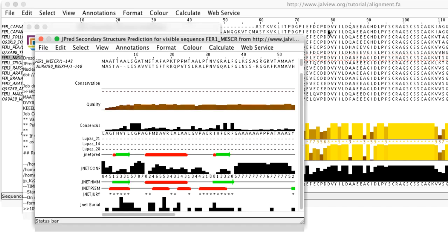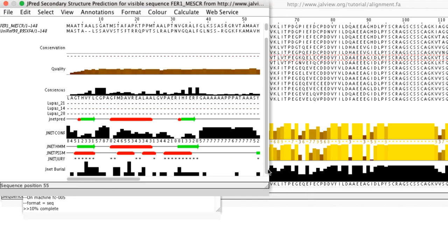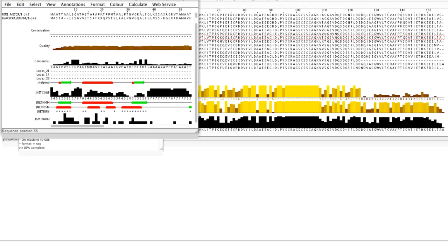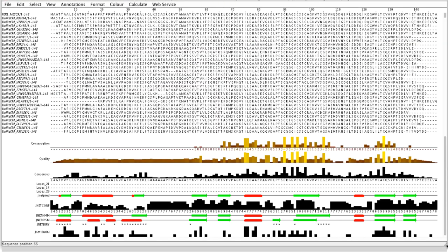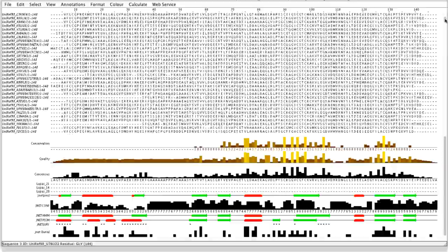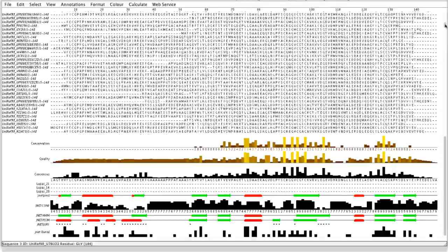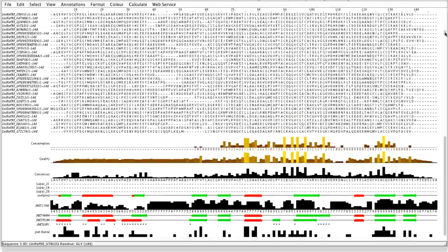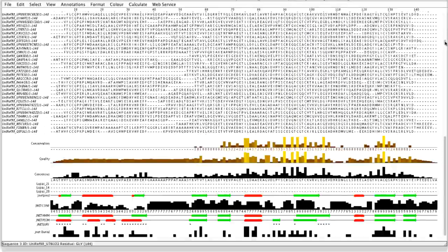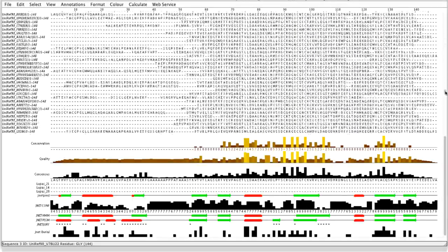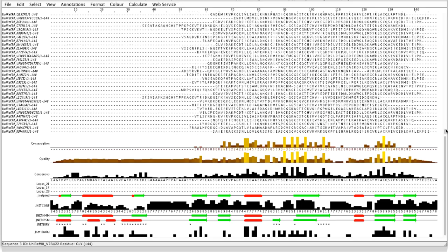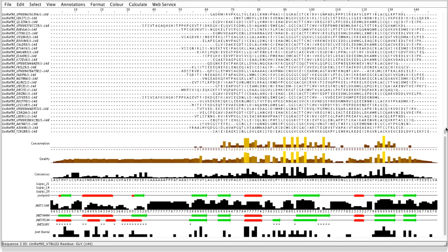Upon completion, a new alignment window opens with the JPRED prediction results visible in the Annotation panel. Note, the number of sequences in the result window is much larger than the original alignment. It is recommended to view the alignment to check the PSI-BLAST alignment is meaningful.